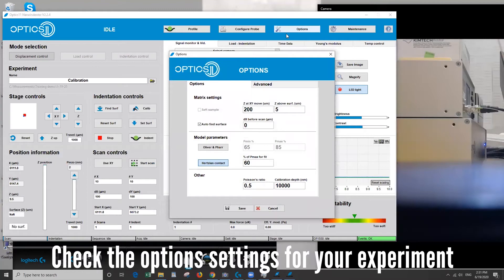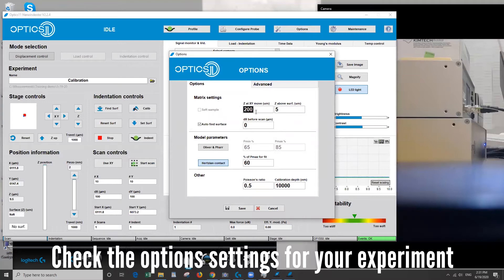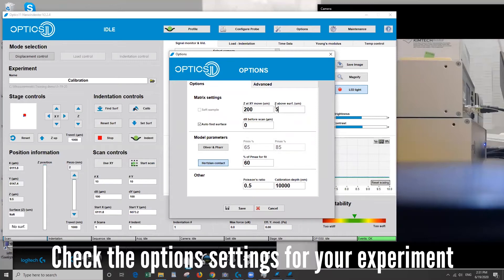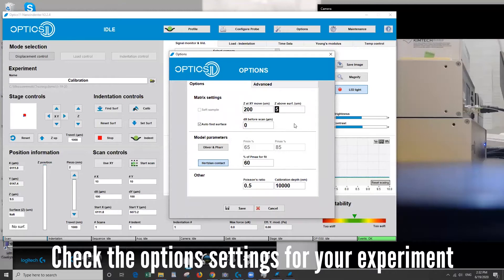Next click on the options and check that things are set how you want. So if you're going to use the matrix check that your matrix settings are raising your tip high enough that it won't crash as it moves in the x or y direction across the surface. This also tells you after you do an automated approach how far above the surface should the software lift the probe after it finds the surface.